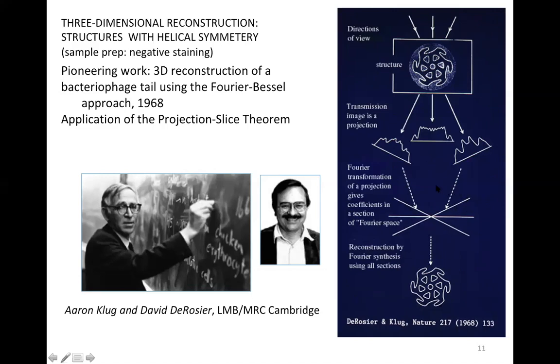And so you retrieve the information in the three-dimensional Fourier transform, and then all you have to do is go back into real space by a three-dimensional inverse transform. So that in a nutshell is a recipe for three-dimensional reconstruction.